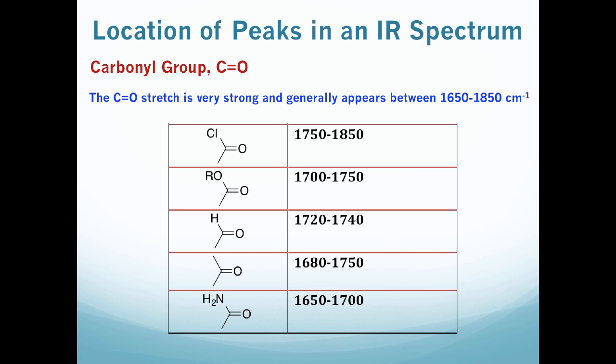Now we're going to move into the double bond region. And the first thing we're going to take a look at is the carbonyl group, C double bond O.